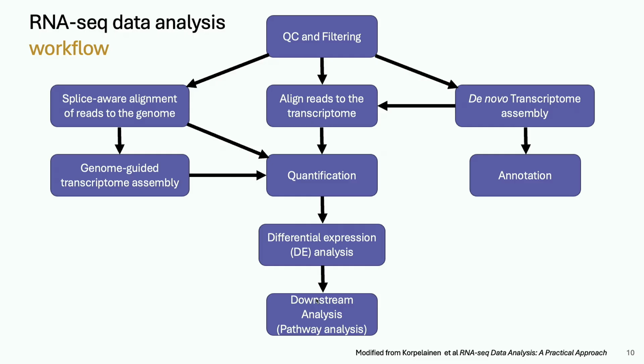So the way to do it is using specific alignments called splice-aware alignments. If you're looking at splice site variants, I mean the effect of a splice site variant, you would have to align it to the genome. If you're looking at whether a splice site variant is causing a change in the transcription, you would have to align it to the genome, in case the exon gets extended naturally. Because generally we do RNA-seq to look at transcripts, but you can also use it to look at the effect of splice site variants, or the creation of new exons or whatever.